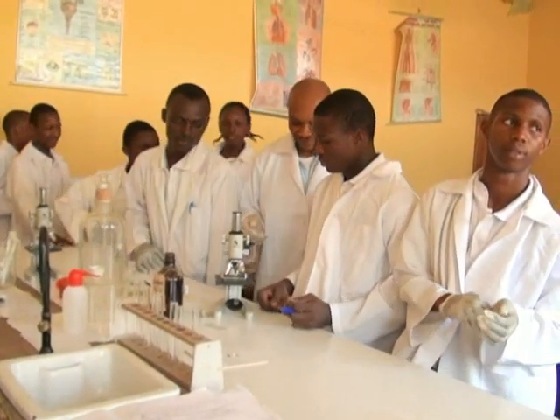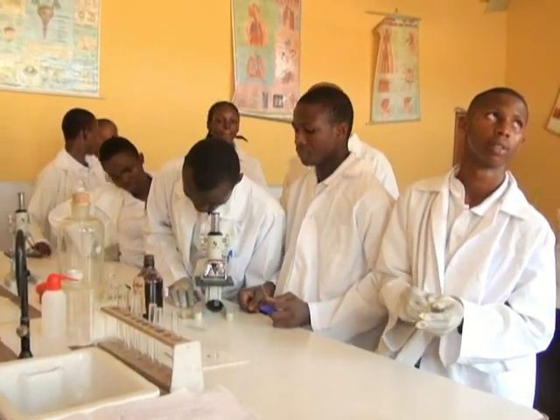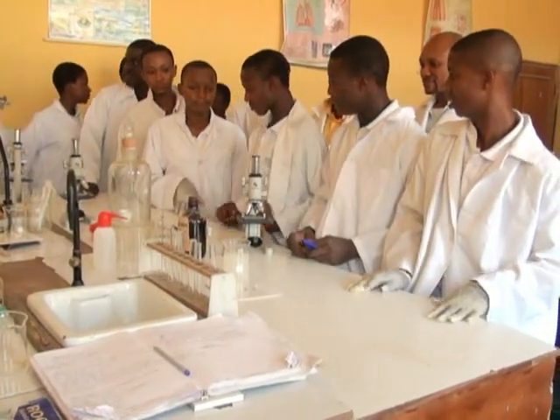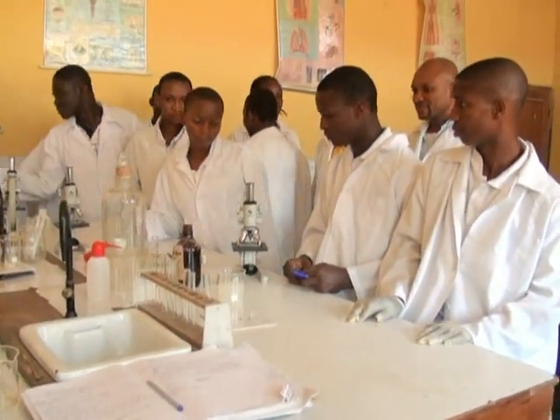The magnification is obtained by multiplying that of the eyepiece with that of the what? Objective lenses.